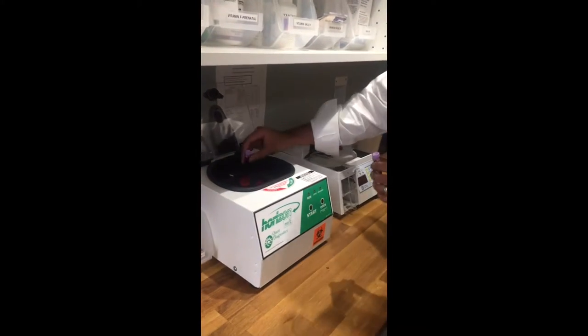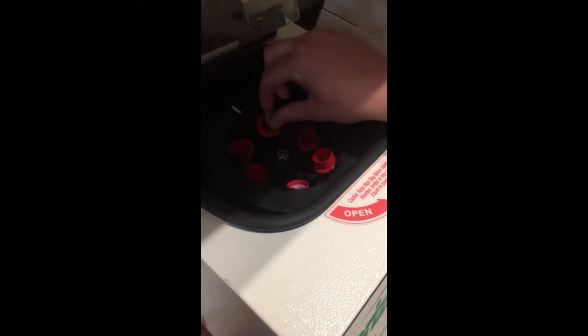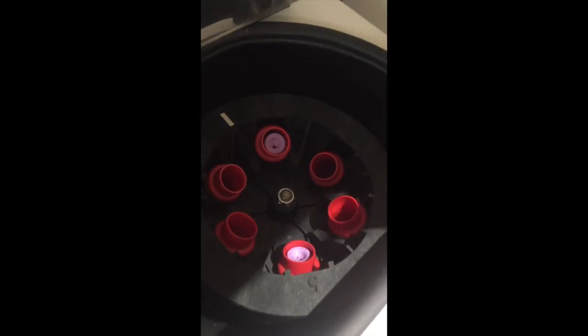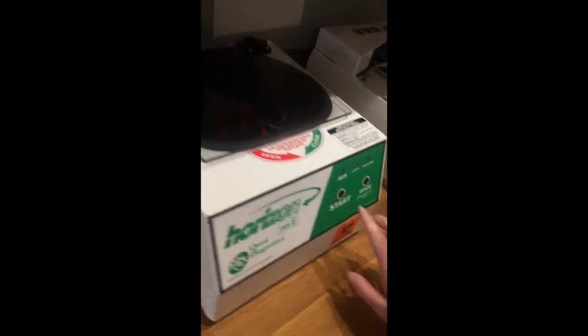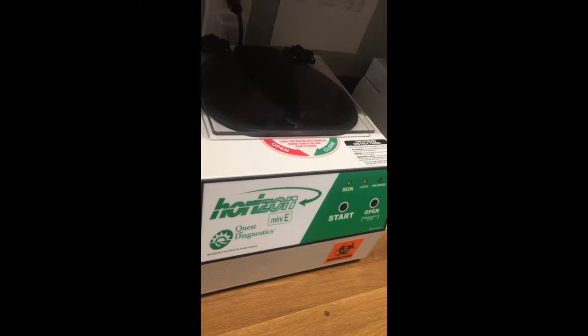You put them right across from each other to make sure that the centrifuge is balanced — they'll kind of fall into the little slots. So they're equally full lavender tops. You spin it immediately after you draw it; you don't have to let it sit. It should automatically spin for the right amount of time.